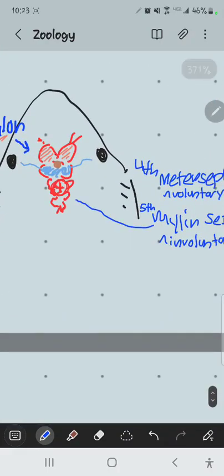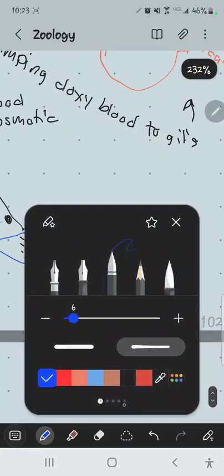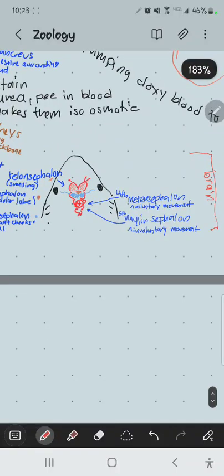Okay, so what's interesting is this is basically what amounts to the brain. And what we're going to see later on, I'm not going to label it now, but these are all the same lobes you have. Your cerebrum, your thought lobe, is your telencephalon. That's why you don't smell so hot. So your olfactory lobe has been adapted in you to be thought and whatever processing.